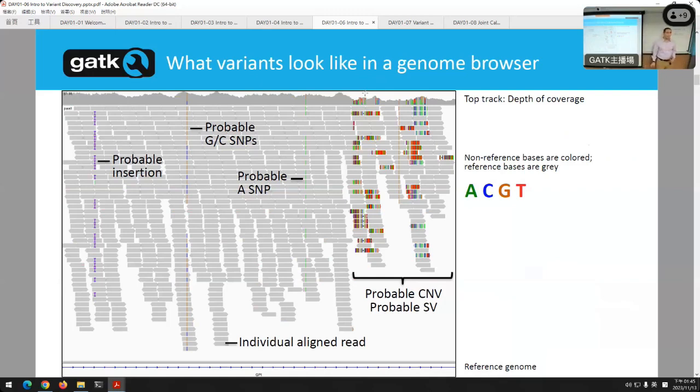And I mentioned those Q2s, where the ends of the reads are not high quality. That Q2 process happens randomly. But in this picture, you see they're all happening at the very similar or same position. So that's no longer random, and there's usually some signal there. And that signal is used to find much larger things hidden in the DNA.